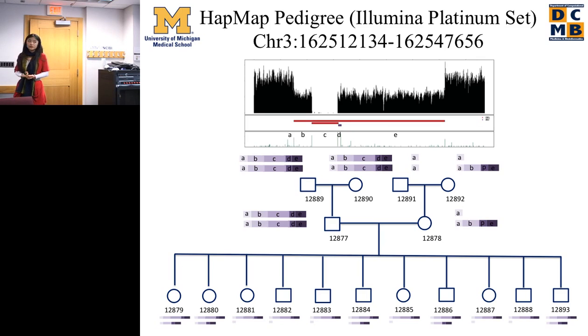This is one reason, and the other is that we set some arbitrary parameters in the algorithm when looking for breakpoints. For example, if a breakpoint is defined by a cluster of aberrant reads, we require the cluster to consist of no fewer than 5 reads.